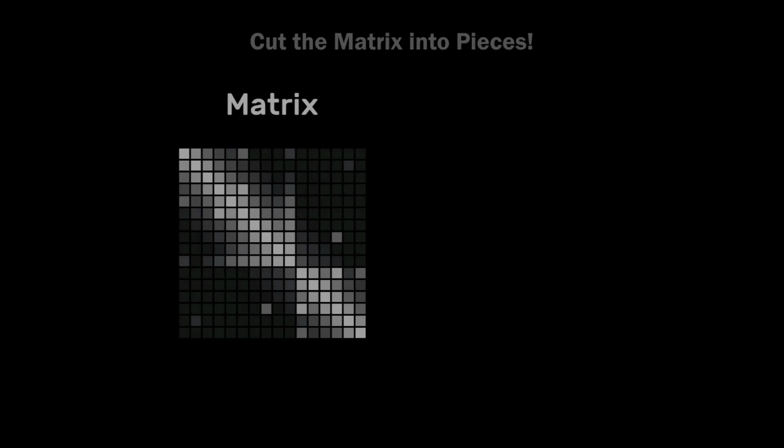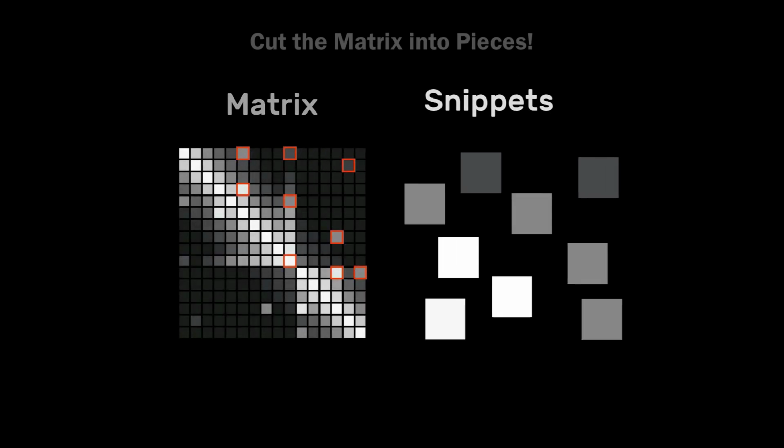In order to look at many things at once in a sparse space, what we're going to do is basically cut this matrix into small pieces. You get rid of all the stuff that you don't care about and just keep snippets, smaller, thumbnail-sized parts of the matrix, and then compare them. So here's our matrix, and these are the things we're interested in. We just cut them out. Within each little block you still have the sequence information, but we remove that from the global context. So now we're interested in some very local patterns in the genome.